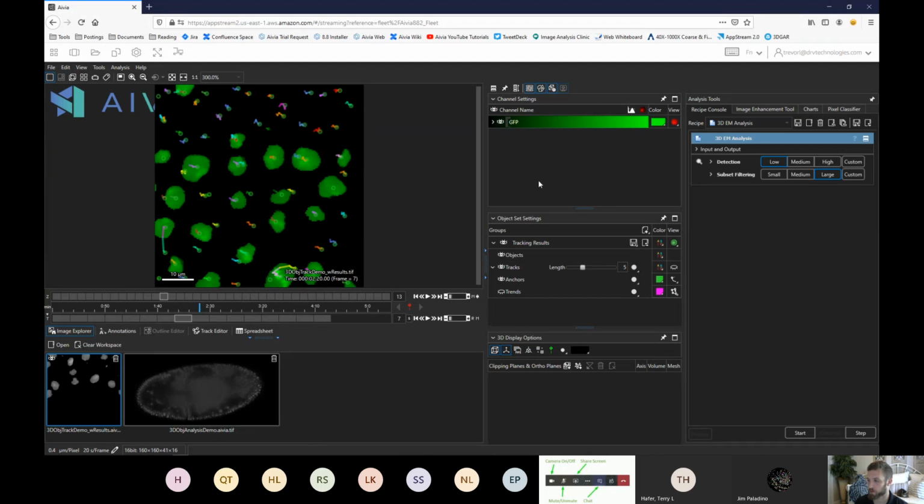Okay, additionally, on this right panel here at the top, we've got this GFP label. This is the channel, or the one channel from the image. You can toggle this on and off by clicking the eyeball. You can also, if you see there are two vertical bars that are very close to each other, click and drag these bars and change the contrast. Now in this image, it's been pre-processed a lot. There's not too much contrast. But you can see that if you adjust those sliders, it's changing what you see there.